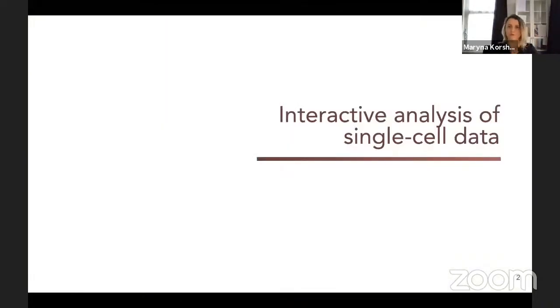So today we start with interactive analysis of single cell data. But as interactive analysis might be performed with already prepared data sets, we already have to understand which kind of metrics we would apply for different data sets, for different pipelines, and actually what is the variety of these pipelines. I would like to make this recap on general single cell analysis pipeline.